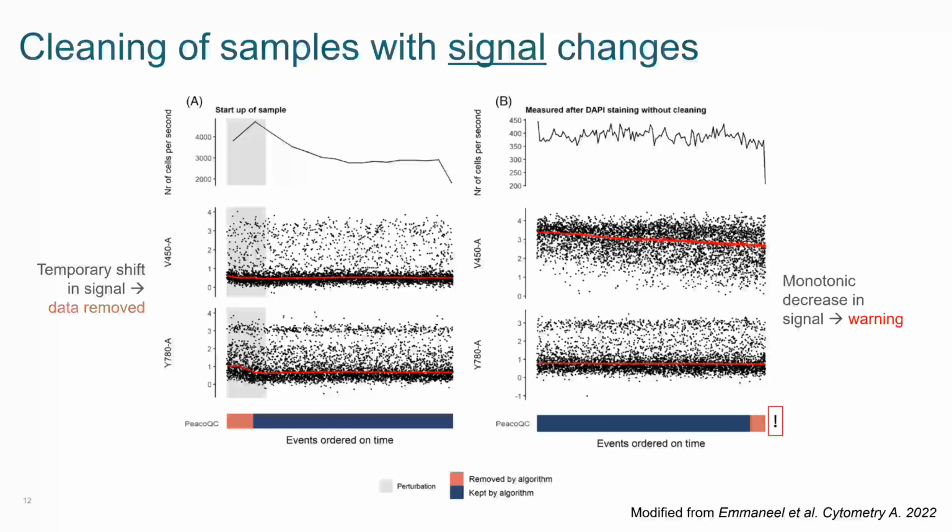Let's see, another question in the chat. In the high-low example, how does it know which one is normal? If the FCS file has an even split between running on high versus running on low, how would it determine which is normal? As a matter of seconds and differences.